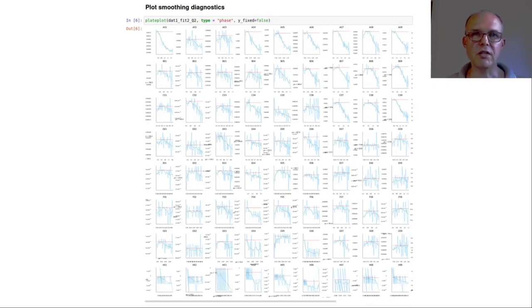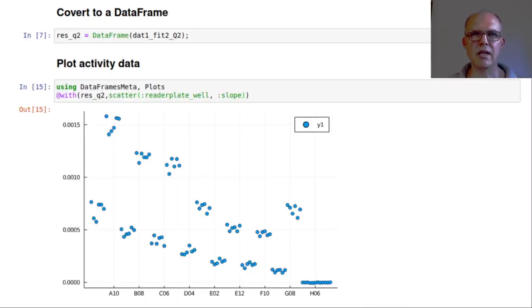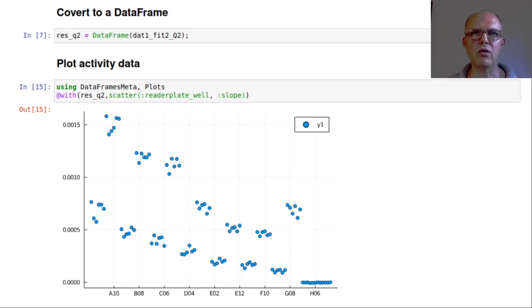I have diagnostics plots like this, which are new compared to the R package. And then I can extract the activity data out into a data frame that I can share with other tools, or save in a spreadsheet, or plot like this.